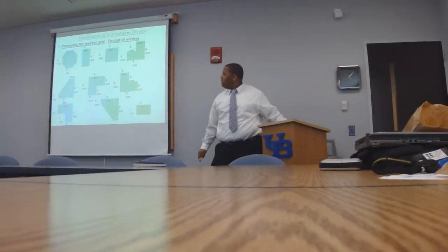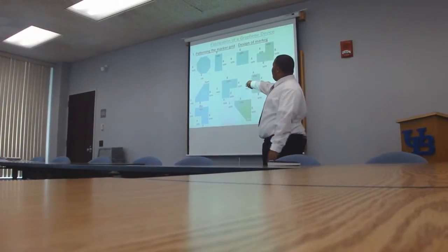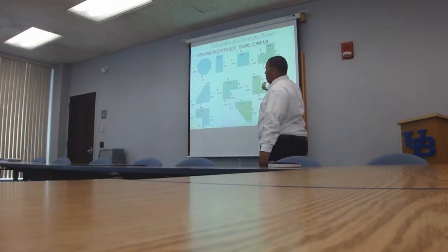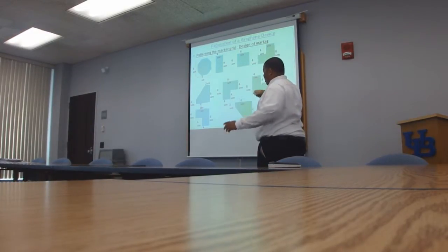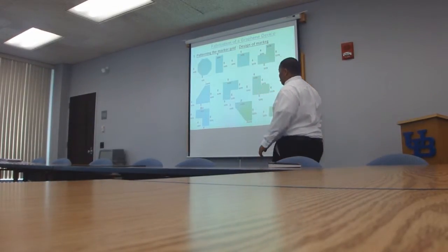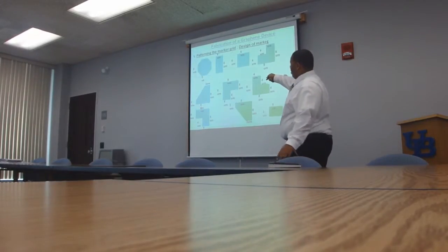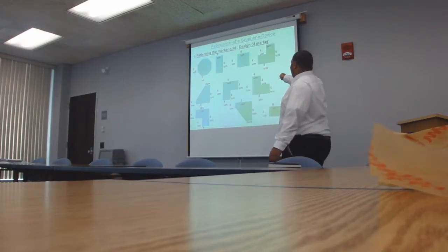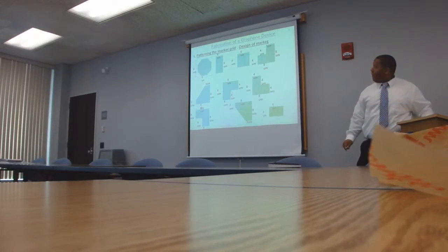This is how the grids look. If you start from the left and go to the right, these shapes represent numbers. On the graphene substrate, it's really hard to find anything, so we go by the grid: from the left is 0, and then it goes on. So this would be 0, 1, 2, 3, and so forth.